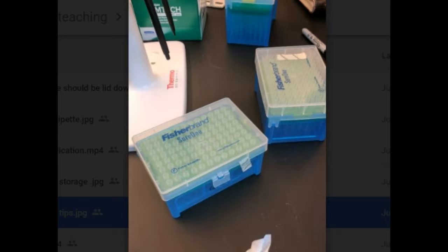So before we talk about the procedures, let me just show you a few videos of us using the pipettes because it is definitely a skill that you need to acquire. So you just saw us holding the pipettes, and then your primary task is going to be to put a tip on the pipette. Never, never, never put the pipette directly into a liquid because then it's basically ruined because you have dirtied it. It's dirty beyond repair. So these little boxes with clear lids are filled with tips.